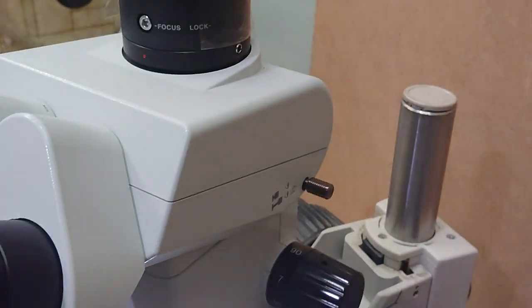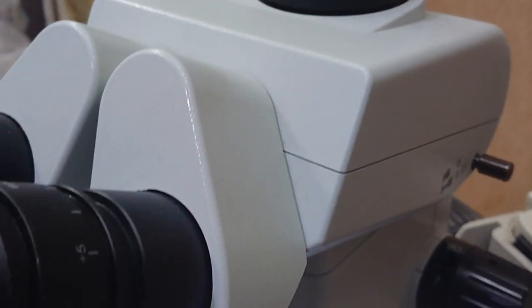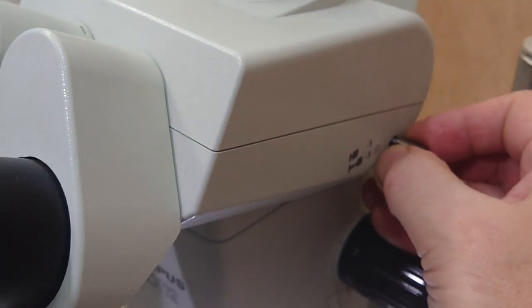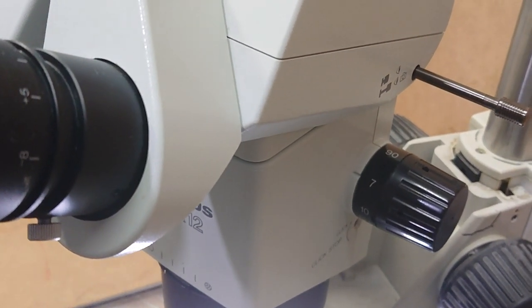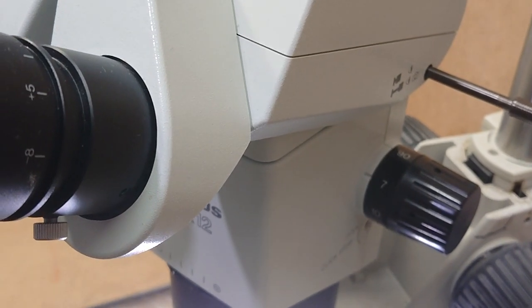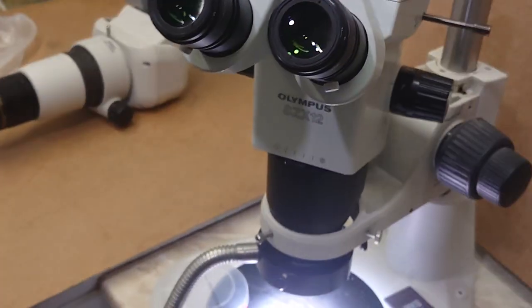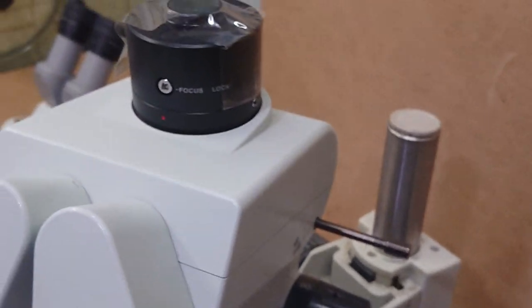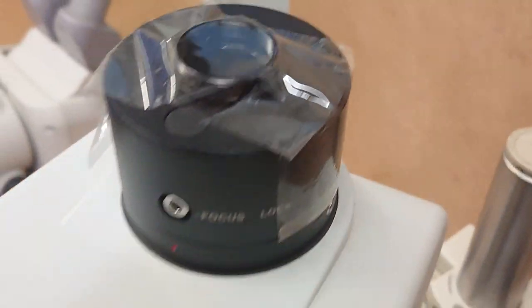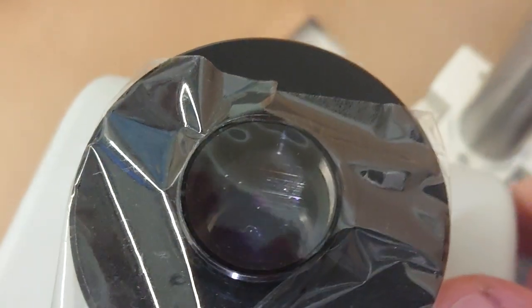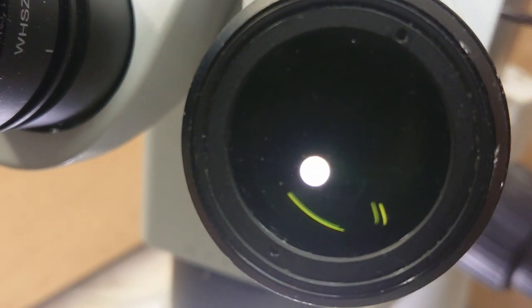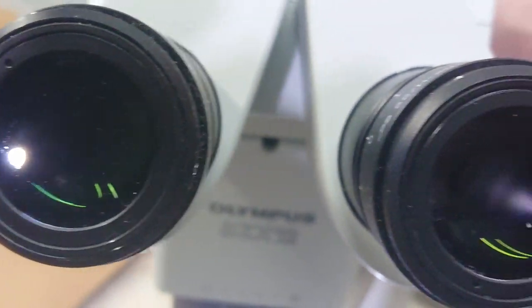In our case we have a trinocular head that has some controlling lever. When we pull it, we're making about 70 percent of all the picture go to the port while 30 percent are left for the eyepieces. So when we switch the port, nothing changes except the brightness. The picture is left on both channels.